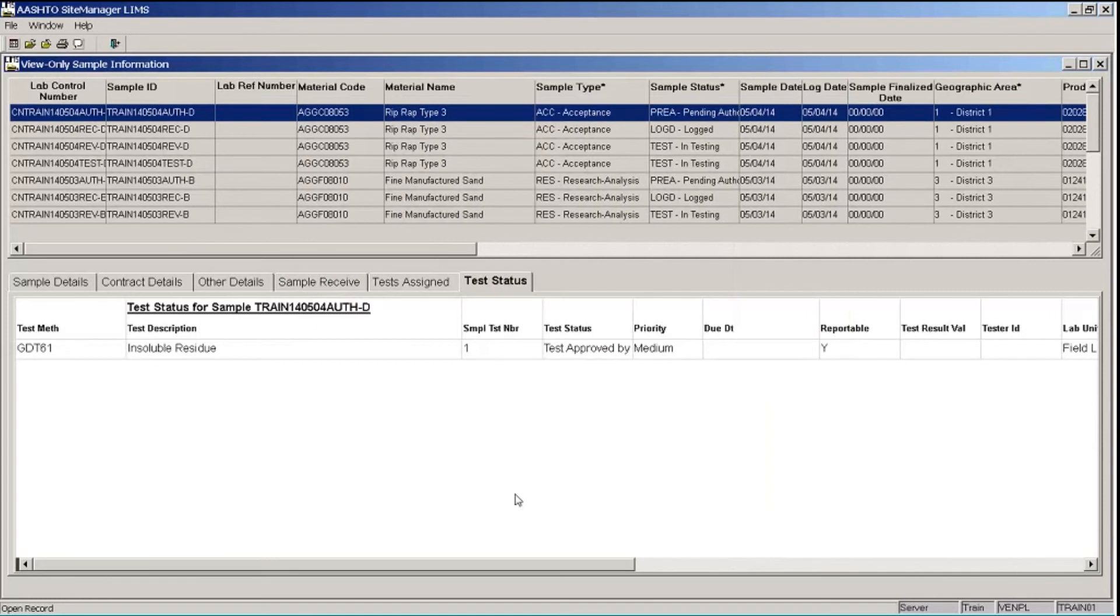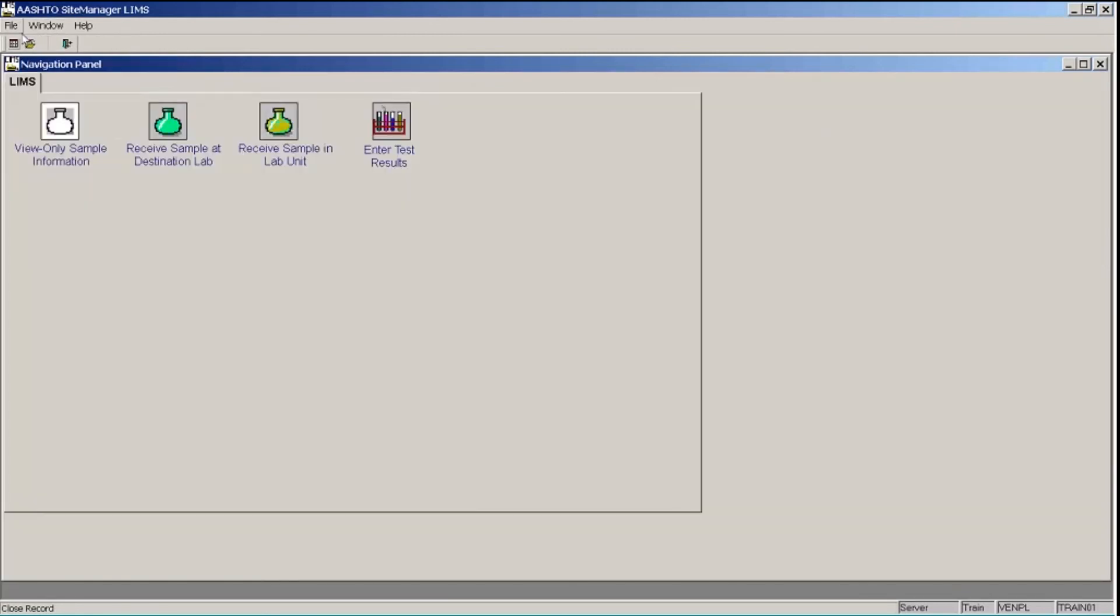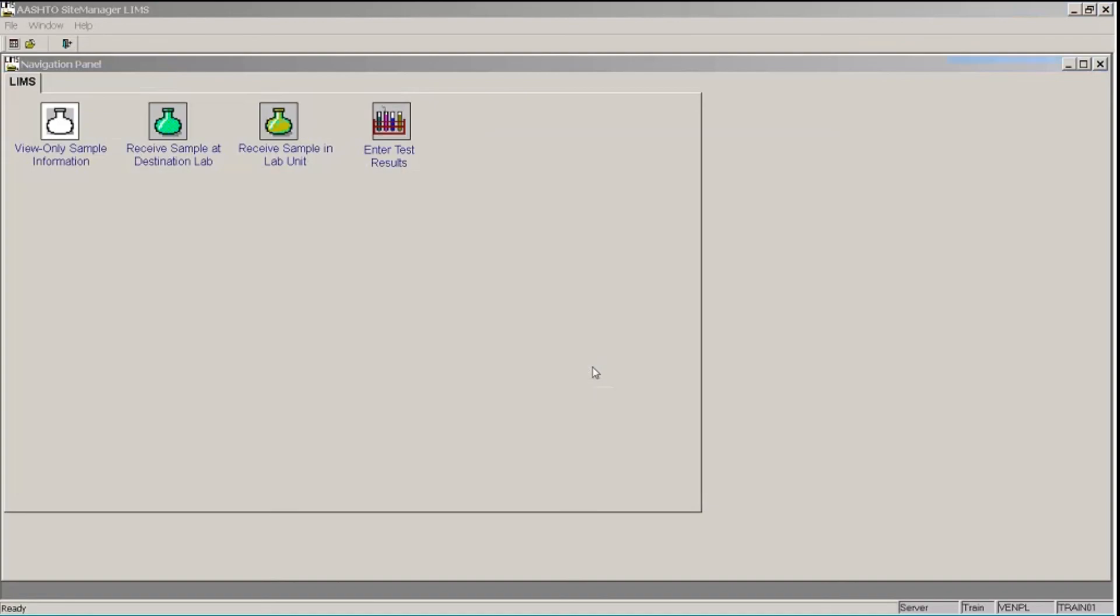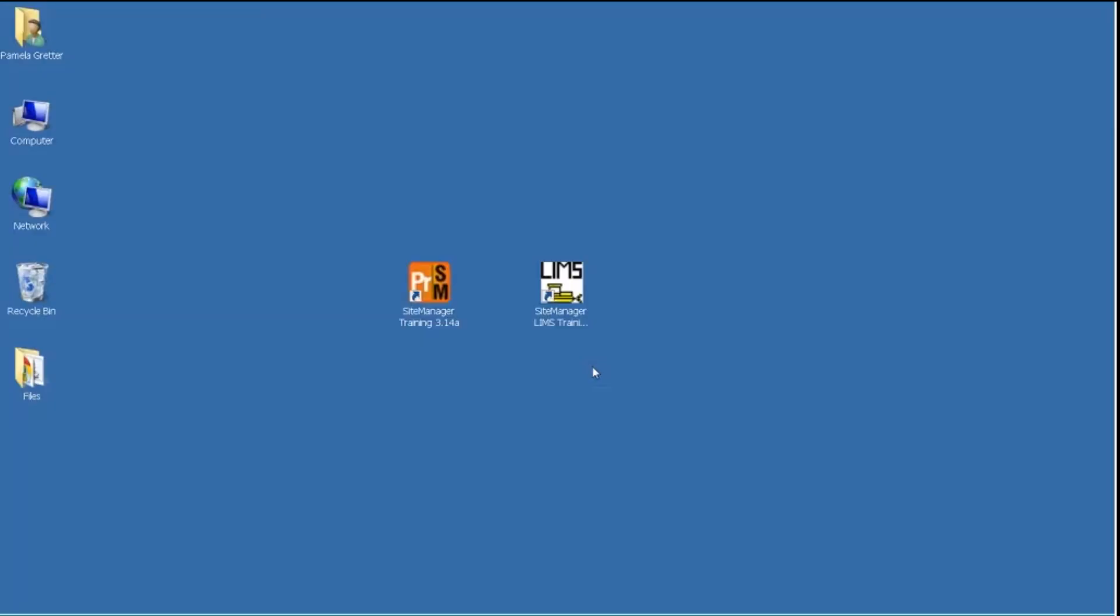So we have reviewed the sample records that I wanted to look at, so now I have finished this exercise and I'm ready to close my window and exit Site Manager. I'll click the Close button on the toolbar, and the File menu, Exit Application, and the Yes button.